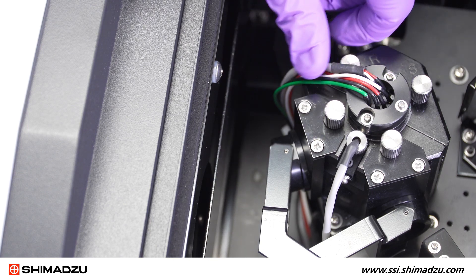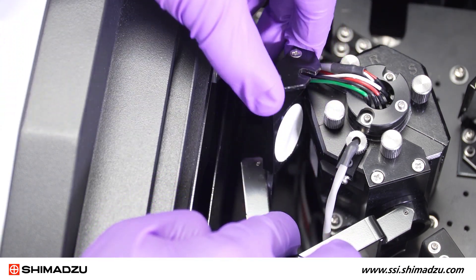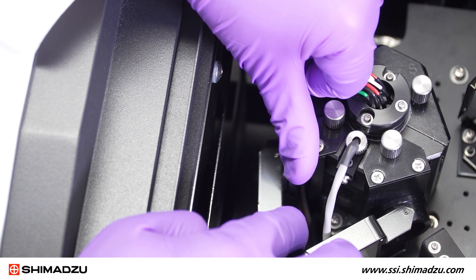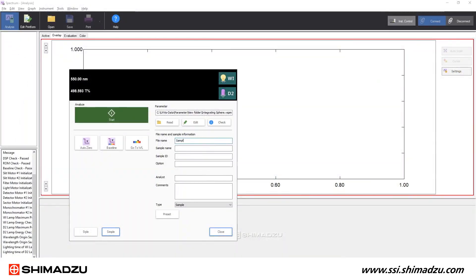If you are using barium sulfate as your baseline material, take the white plates provided and insert into both the sample and reference positions of the integrating sphere. Verify the proper file name for your sample has been selected, then select the baseline measurement button.